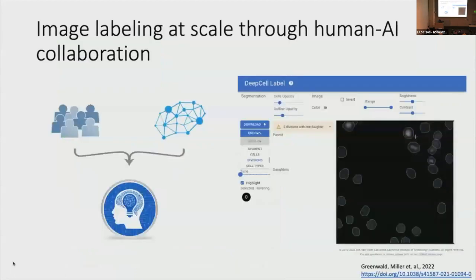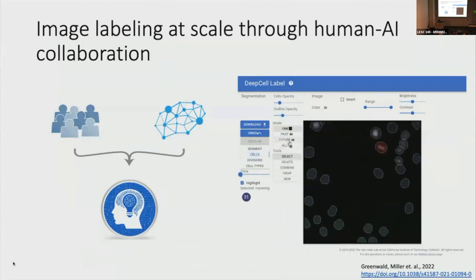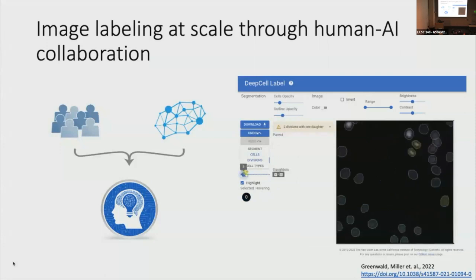And so there are the individual data challenges, each dataset being, quote unquote, hard, but then there's also a scale challenge as well. You just need a lot of examples to get these AIs to work well. And so what we realized a few years ago is that this problem is too hard for the AIs to do by themselves. It's too hard for the humans to do by themselves because of the issue of scale. And so the correct solution is to have the AIs and the humans work together to build out these large datasets. We've built software systems to enable this sort of interaction. And the key thing that you should take away here is that the way in which you get scalable labeling is by having humans correct model mistakes, because then you can take advantage of your model's improving performance as your labeling process continues.